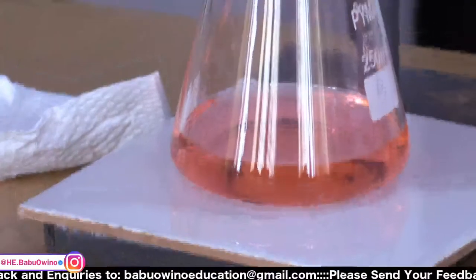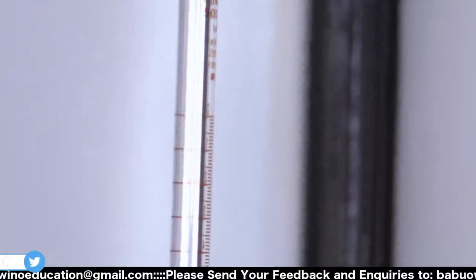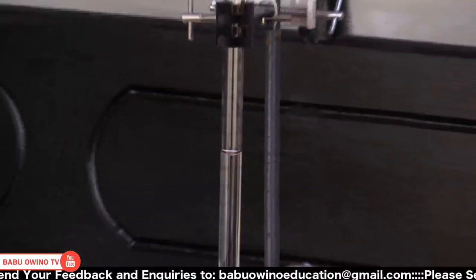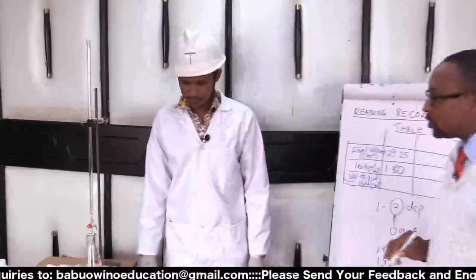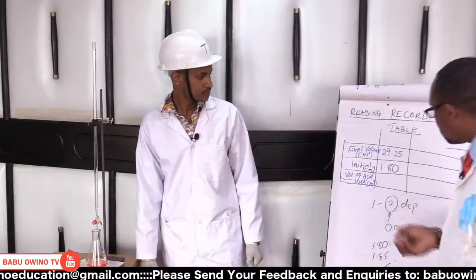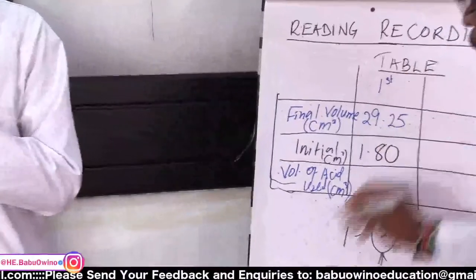Now let us make the readings. Our reading here is 29.2. Remember to be very careful. 29.2. If you're in pairs, you confirm. Twenty-nine point two five. According to this, let us use mine. So this is the first exercise.